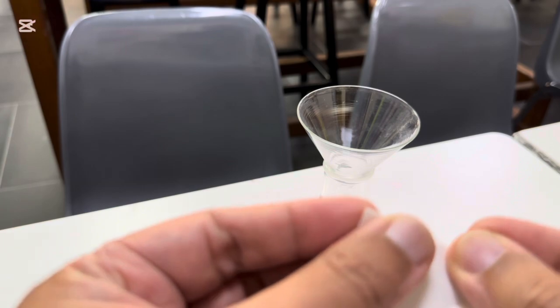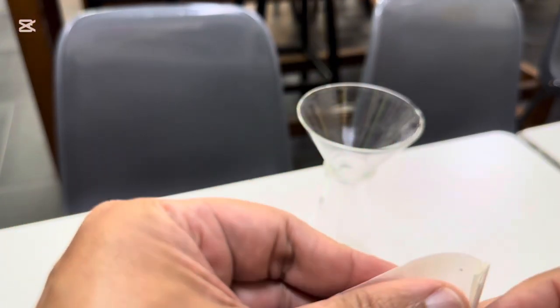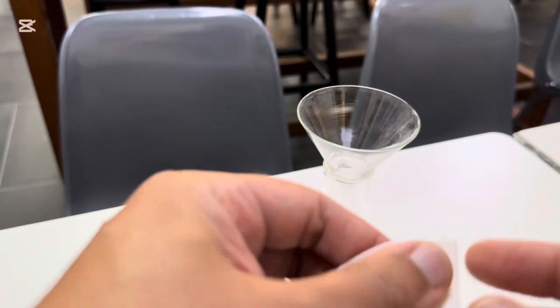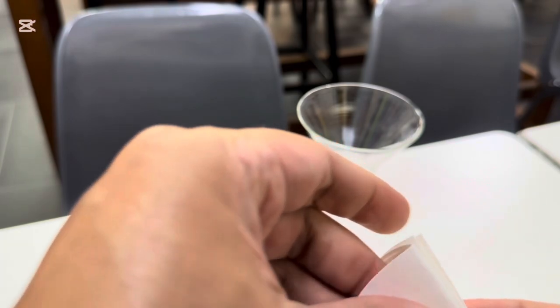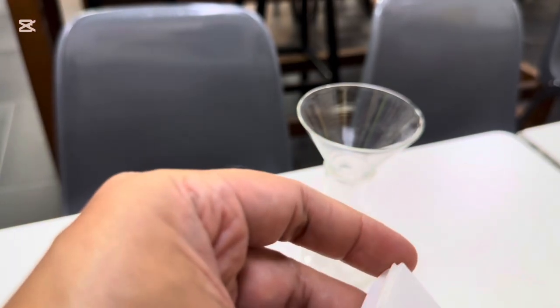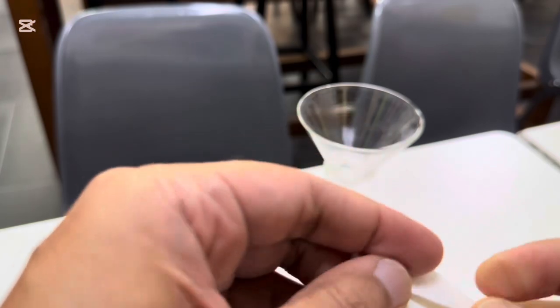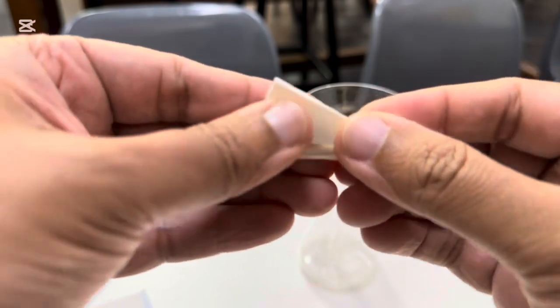Start by folding one of the sections again, fold it, and then fold it again. It doesn't have to be completely neat, so long as it doesn't tear. Okay, just fold it and fold it and fold it.